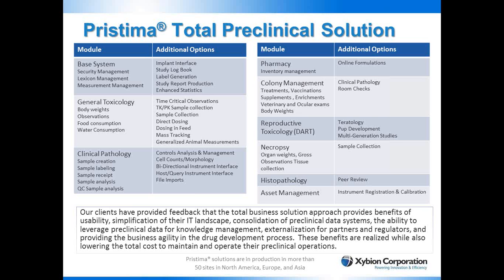As we mentioned in the beginning, while we focused on one very narrow area within the Pristima platform, there are certainly other key functional components to it, including the base system, the toxicology module, the clinical path module, pharmacy, colony management, etc. Clients that have deployed the total preclinical solution have taken this approach and reported back to us a great deal of benefits on the usability, the simplification of their IT landscape, the way that they've been able to consolidate many different preclinical data systems and leverage one for knowledge management as well as even potentially externalization to partners and regulators.